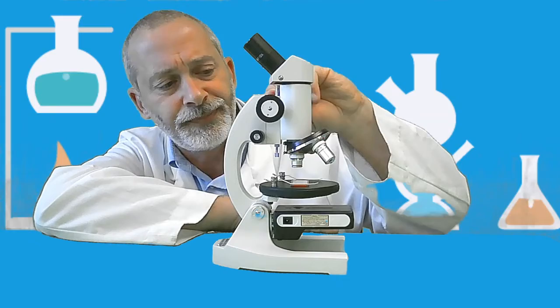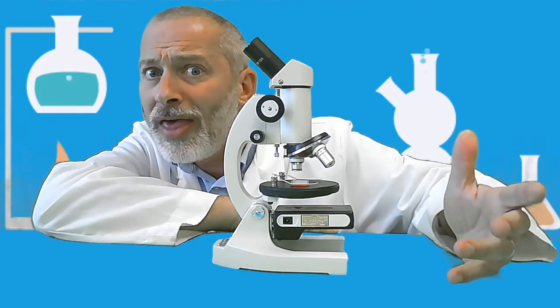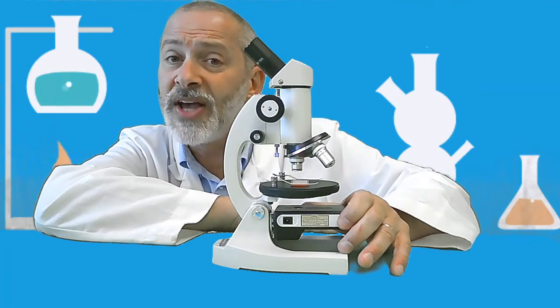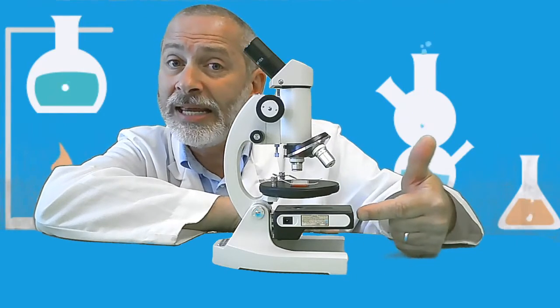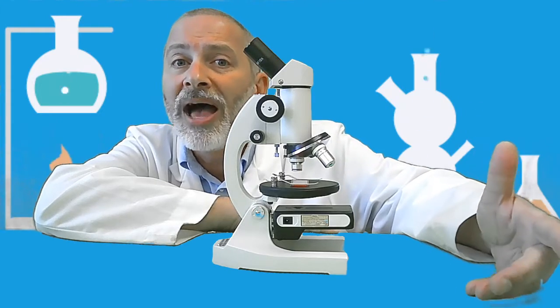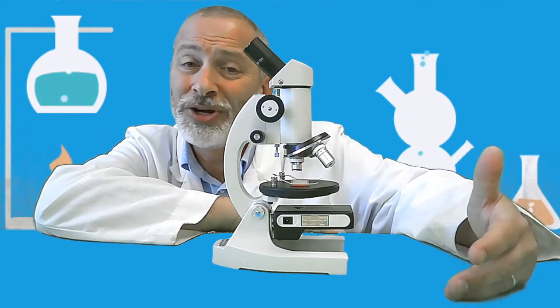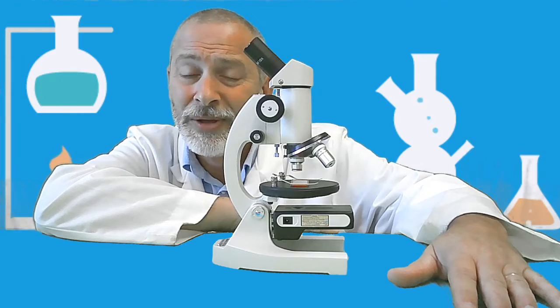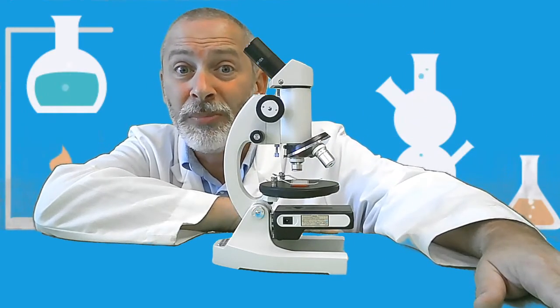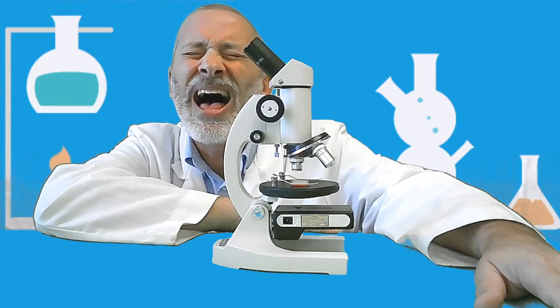But since you're not magnifying it all that much, relatively speaking, when your lamp is on, when you're illuminating it with the light, you always want to start with low power. You don't want to turn it on full blast because when you look through the eyepiece lens, you're going to be blinded by the light.